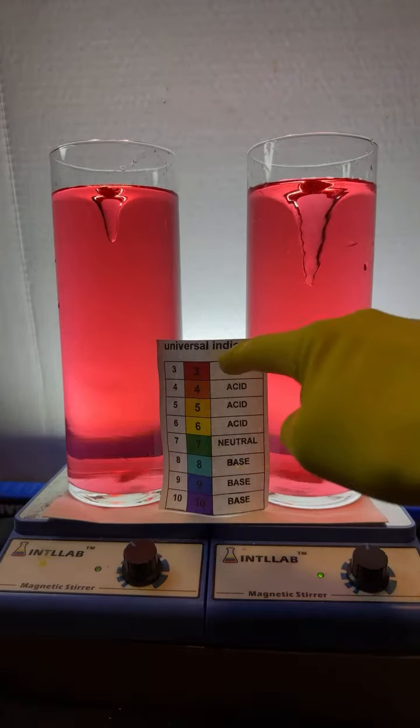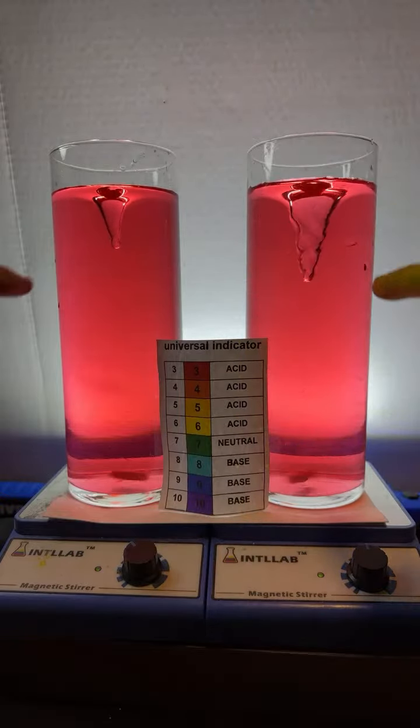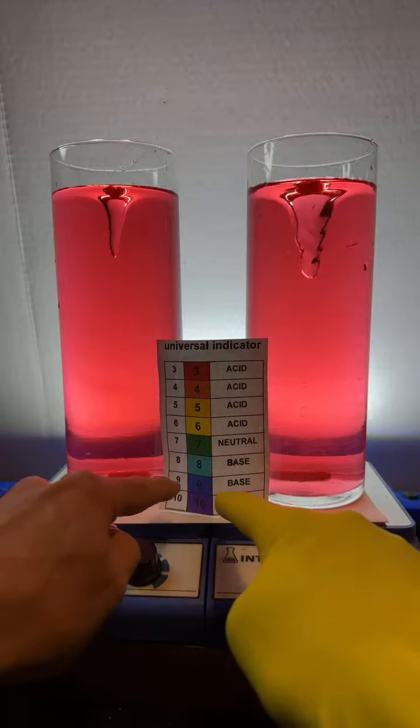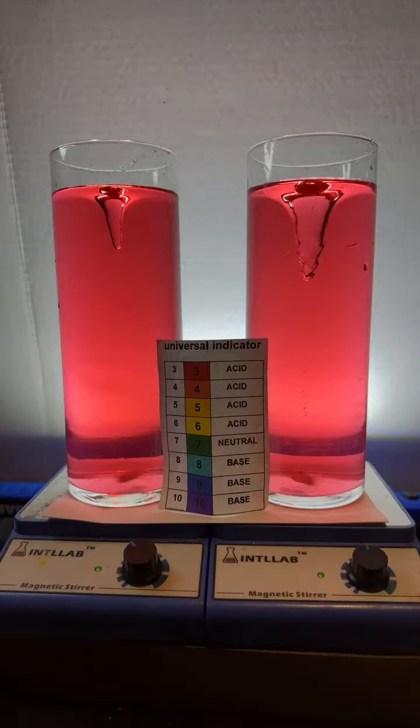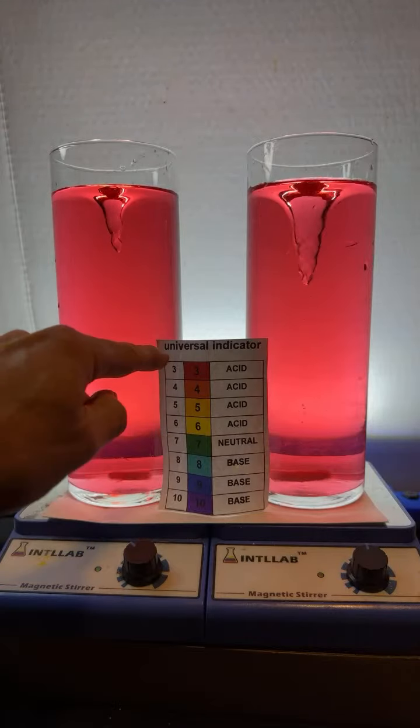So the indicator I'm using, from pH 3, 2, 1, keep on going down, this will stay red. And at pH 10, that's the high end that the indicator will display. So Zachariah wants some green. That's tough to get, but we're going to go for it. Here we go. To get the green, I need to neutralize the acid, so I'm going to start adding base.